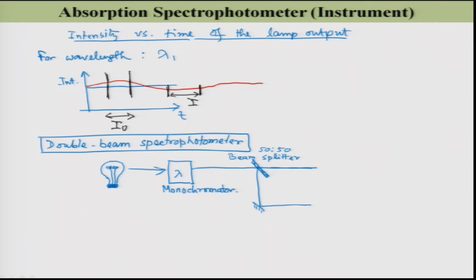Now, you could have your sample cell over here and here nothing, right. The color of my sample was just for consistency. Here is your sample, and here is nothing, right.